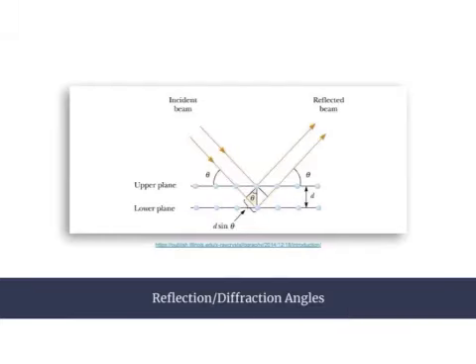For understanding reflection and angles and how distance and angles themselves play a really big part into this, we're going to look at this kind of diagram. Some of the big things to look at is, as I mentioned, there's the two types of distance. We're going to be looking at the distance that's between two planes, so we have an upper and a lower plane, which is going to be our D, and the angles. So we have our incident beam coming in and creating a contact angle, and then we have the angle that we're going to be using for a lot of our measurements, which is this inside angle that's found through the law of congruent angles. We're not going to get into all of that. Just know and take away that this is the angle we're actually going to be looking at. It's formed by two different perpendiculars.